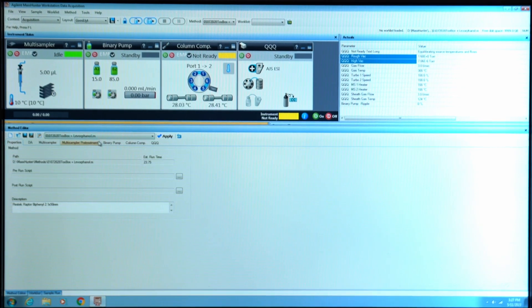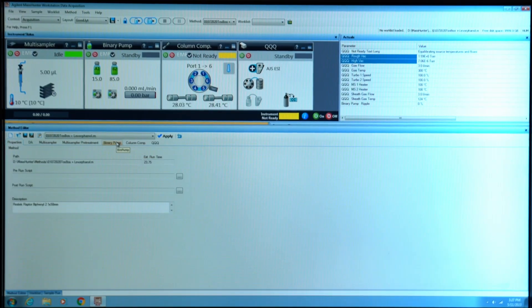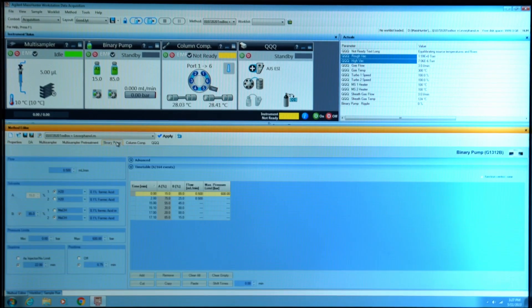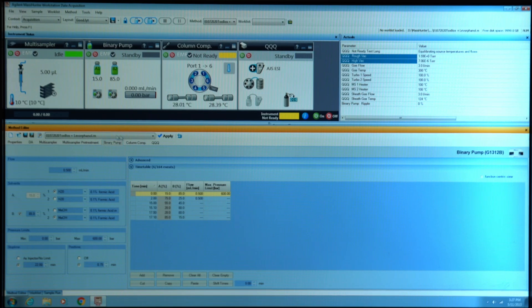Go to binary pump where you can see pump A and pump B.